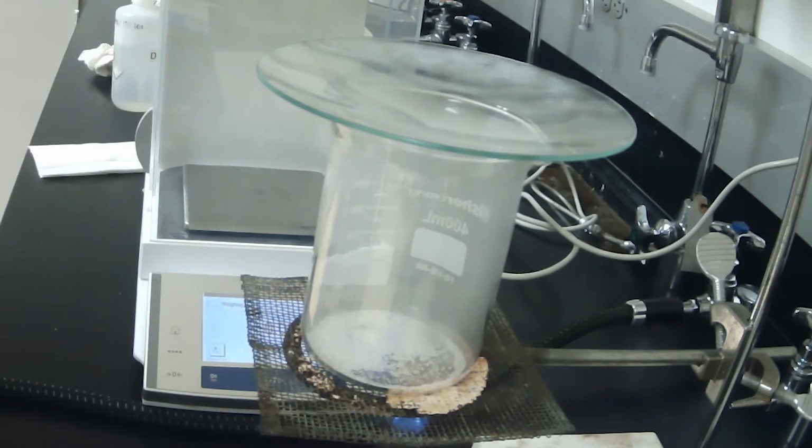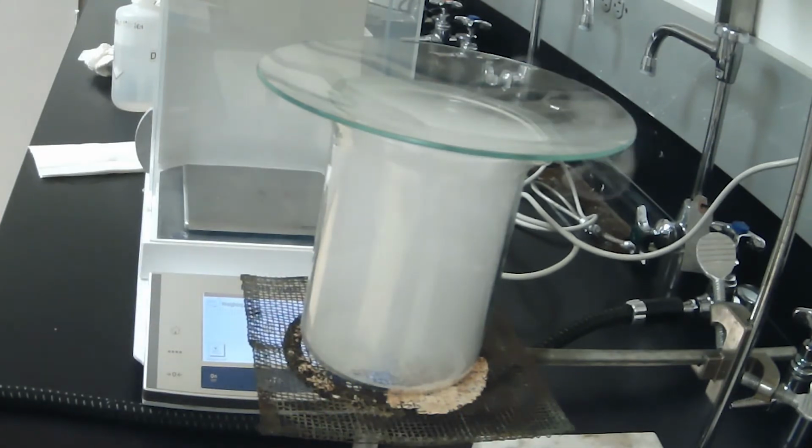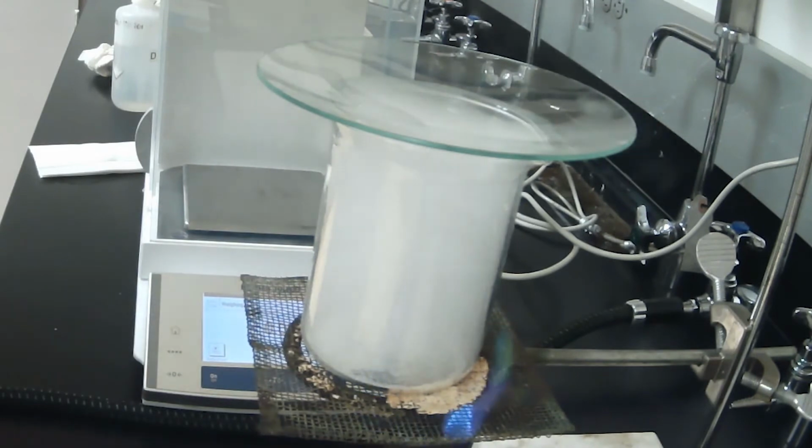As the ammonium chloride turns into a gas, because of the heat, as soon as it reaches something cool, it turns back into a solid. And the solid in the air is actually what gives us a smoky type appearance. Now, our goal is to remove all the smokiness out of the bottom and let the ammonium chloride recondense on the cooler parts of the glass.